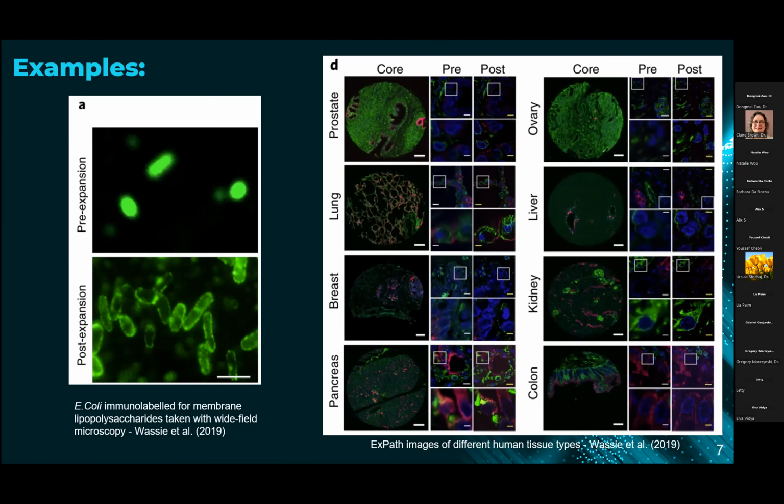That would be very interesting. It would be very difficult because it's just not a soft tissue. It doesn't seem very easily expandable. But maybe someday that'll be possible, because if you can link your biomolecules of interest and then homogenize it and still put it in that polymer matrix, it should still be physically possible to expand.